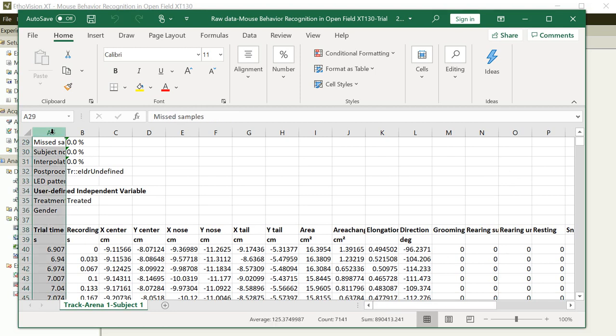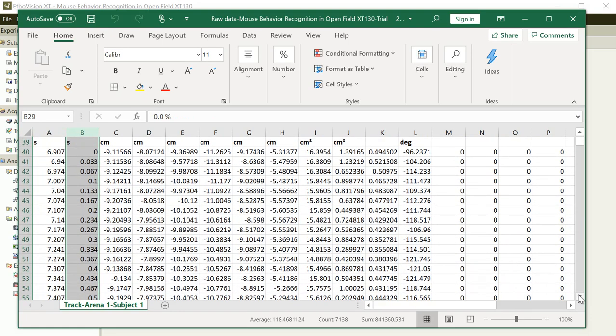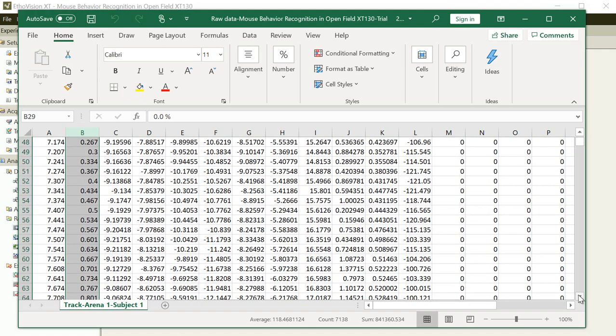So it is time based. This time the sampling rate of data acquisition is, I believe, 25 or 30 frames per second. So if I mention the time frame of the sample, basically, as we are familiar with, the time frame of the video is 30 or 25. It is different based on NTSC and PAL, the region.